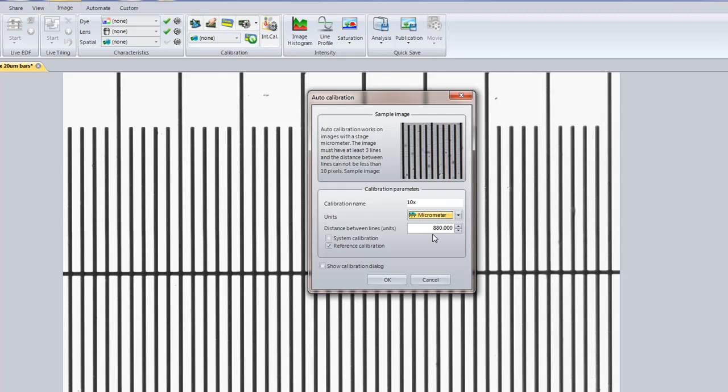And next, I need to tell it the distance between the lines, between either these ticks or hash marks. In this case, this is 20 microns.